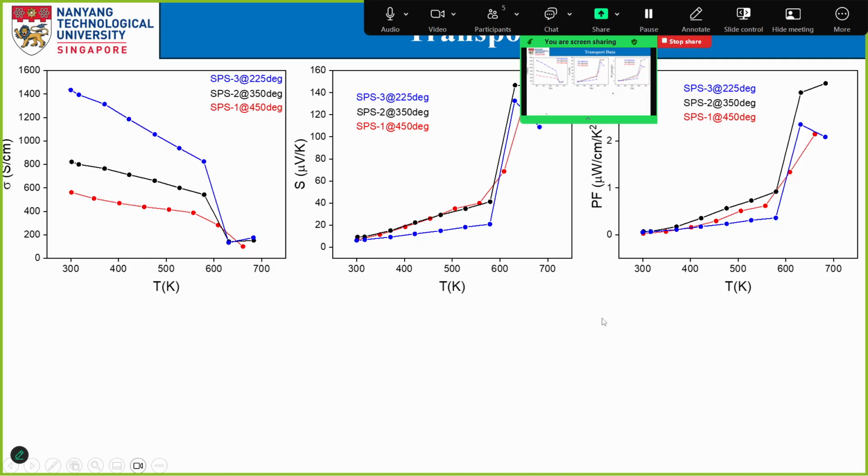This SPS is done because we had to compact it later to measure thermoelectric properties. This is non-ideal. Ideally, you want to take the sample as is from DJS and cut it, if it's big enough and there are no voids, but then it depends, right?